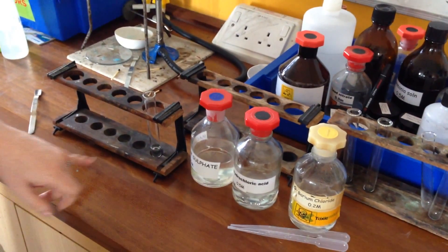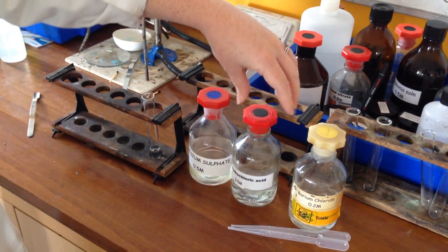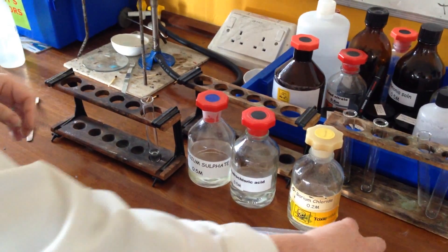This is a test for sulfate ions. In here I have some magnesium sulfate. I'm going to add in sequentially hydrochloric acid and barium chloride.